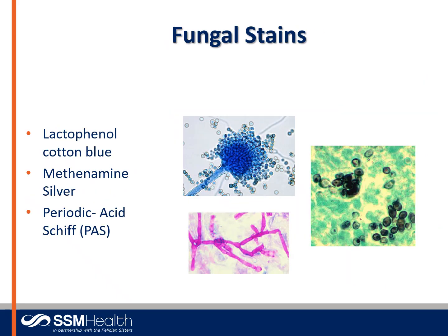Okay, we're going to look at a few other fungal stains that are not fluorescent stains. Lactophenol cotton blue is a very common stain in the microbiology lab, and it's used to stain fungal structures. It is made up of lactic acid, which preserves the fungal structures, and phenol, which actually kills any living fungus, and cotton blue. The cotton blue stains the chitin in the fungal cell walls an intense blue color. So you can see, this is an example of an Aspergillus species, and you can see the structures very well.